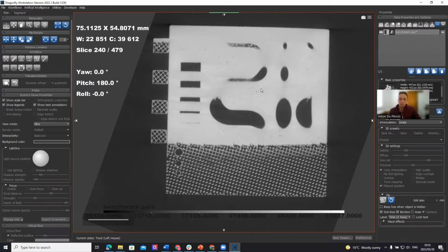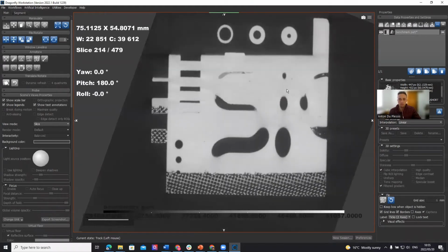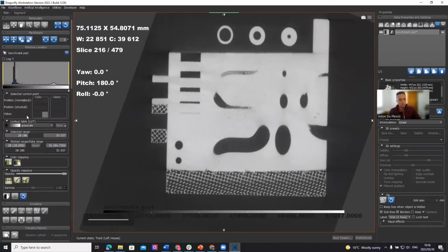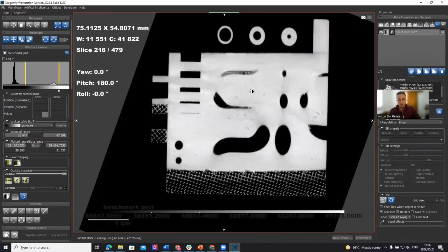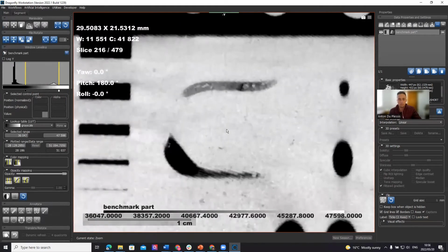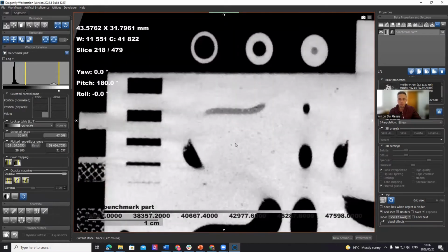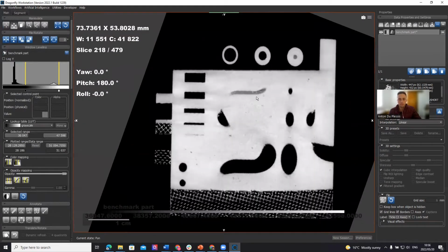This is a part made of aluminium, and it's been intentionally used here because of a number of defects. Typically, you want to scroll through the part with a good contrast and look for internal channels, for example if there are powders inside. If you go to Window Leveling, which is the contrasting tool, you can select this little auto contrasting box and drag it to enhance the contrast in the areas of interest. Press the escape key to get out of that mode and zoom in to evaluate that.